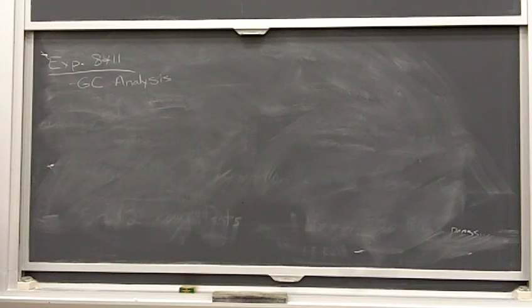Like I was talking about last week, with all the alkenes, we don't have standards for every possible alkene that you guys could have made. We have 6 different ones, 3 heptenes, 3 octenes, and we've shown you trends in positionally where that double bond is and how retention times vary with cis versus trans, okay? So make sure that you use that information to help you identify all your alkenes.